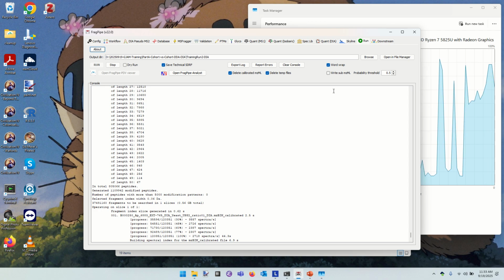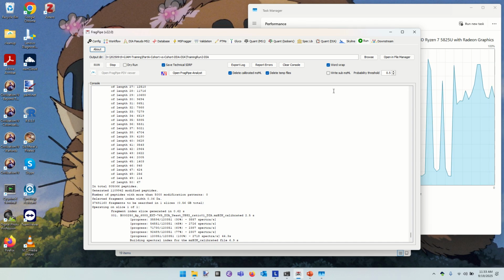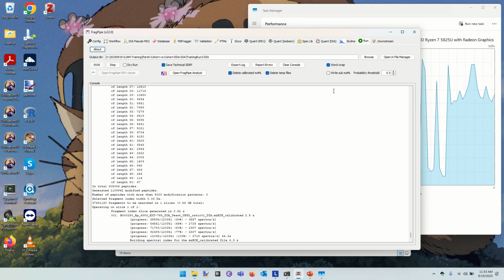In DDA, each MSMS is triggered to take a snapshot of this particular peptide ion. It had a big signal in MS1, therefore we think we can get a high quality MSMS by targeting something at that mass to charge. So this MSMS should represent a bunch of ions of this particular precursor mass to charge breaking, and we're measuring their fragments in the MSMS.